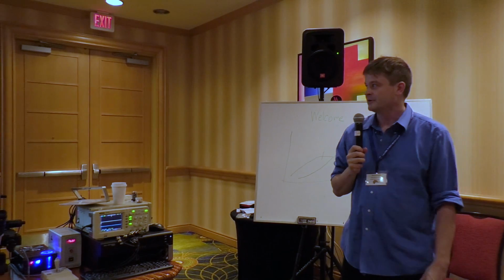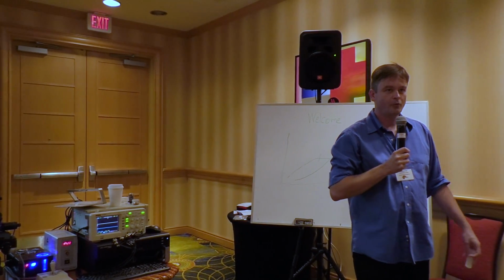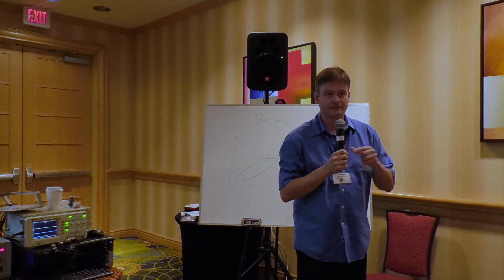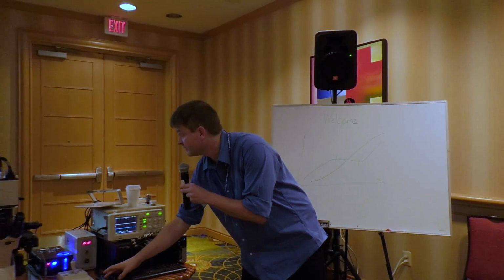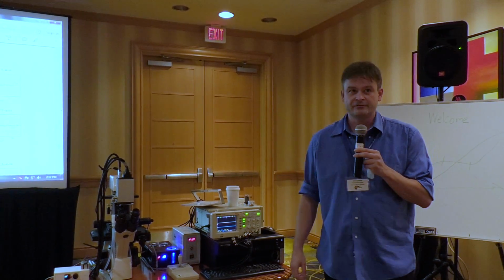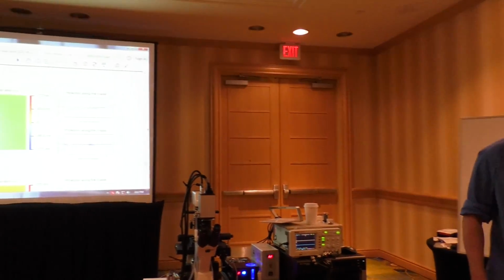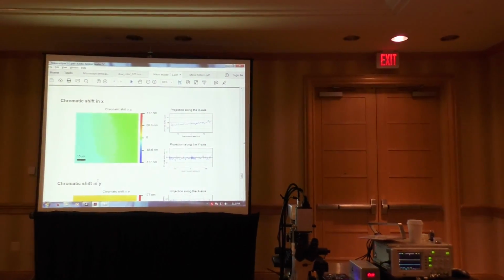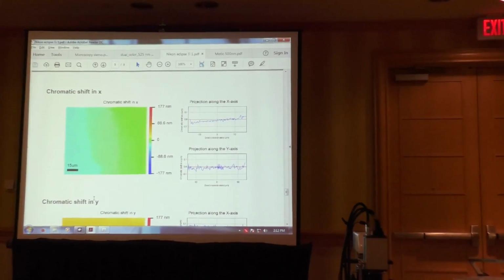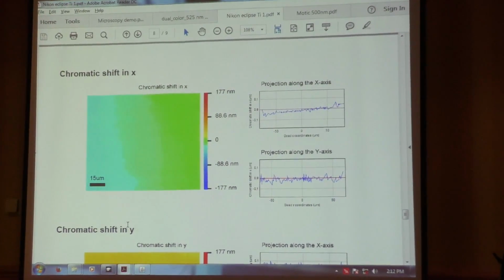Okay, so the argument is being made that if you have Z-stacks, you should get the same signal width. And while that is a nice hope, the problem is that the signals are physically different in size in different parts of the image. So even if I project them, they stay larger. They're just larger. The objective does not produce a uniform function.